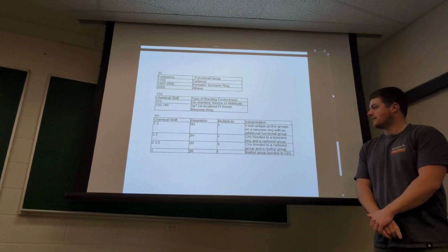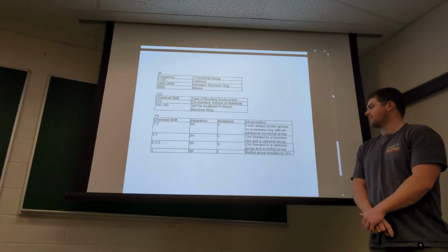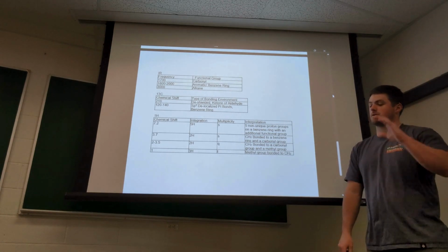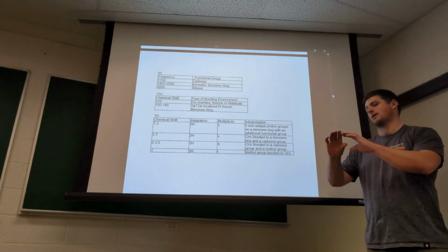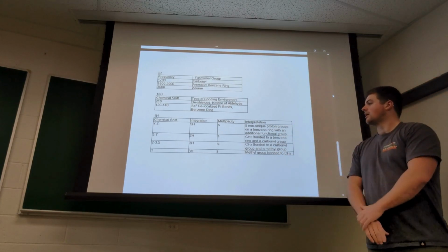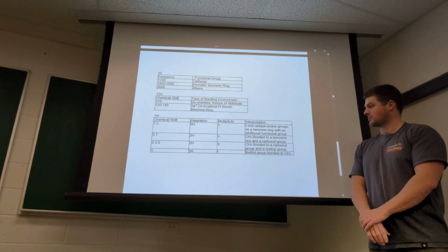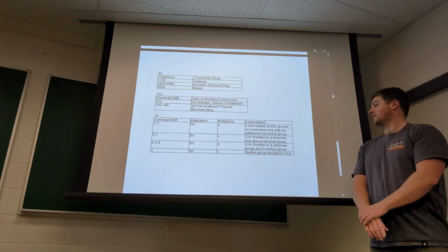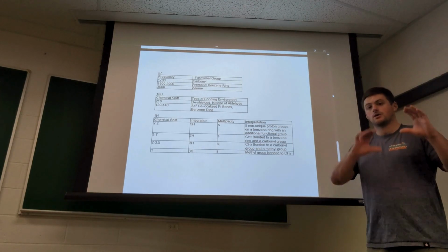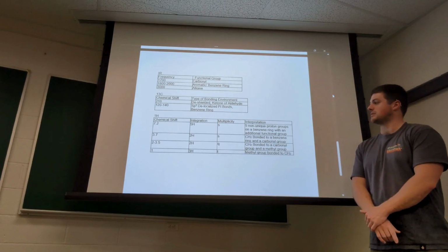At 2 to 3.5, we see 2 hydrogens with a quartet multiplicity, which would indicate that that could be a carbon with 2 hydrogens bonded to a carbonyl group and a methyl group. And at 1, we see 3 hydrogens with a triplet multiplicity, which would indicate a methyl group bonded to a carbon with 2 hydrogens, which aligns very well with everything else we've seen.